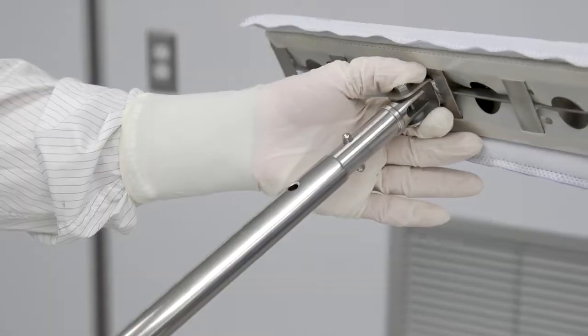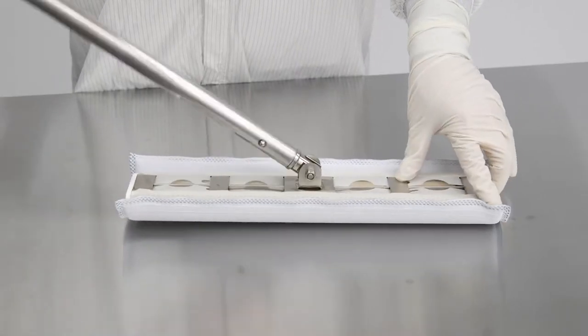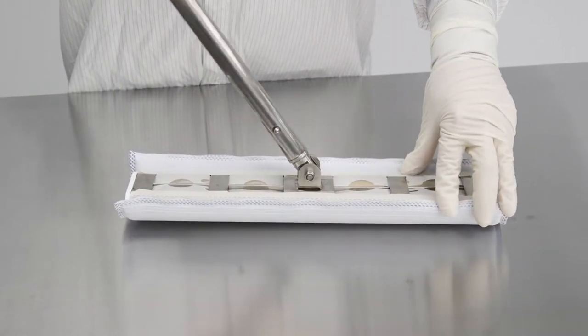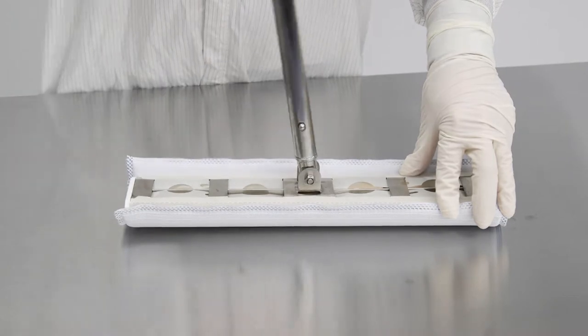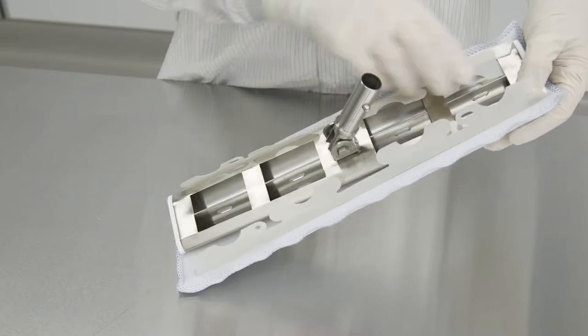Push the quick connect handle into the mop frame. Adjust the pivot nut so that the mop head pivots as needed. The mop head can easily be removed by unlatching all the tabs from the frame.